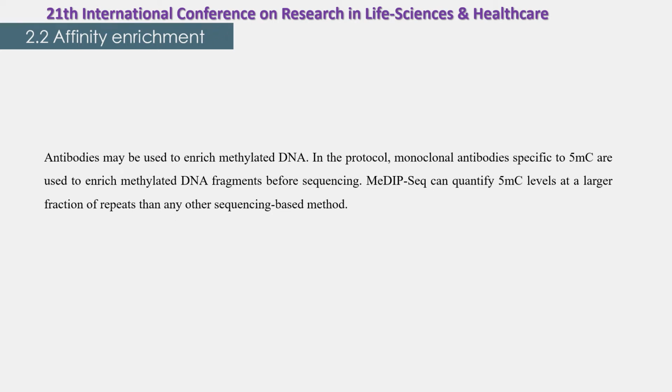Antibodies may be used to enrich methylated DNA in the protocol. Monoclonal antibodies specific to 5mC are used to enrich methylated DNA fragments before sequencing. MeDIP-seq can quantify 5mC levels at a larger fraction of repeats than any other sequencing-based method.